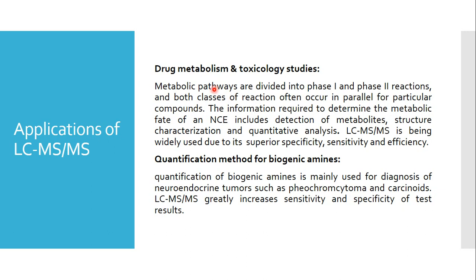Now let us see the applications of this technique. The first application is drug metabolism and toxicology study. As we know, whenever a drug enters our body, it undergoes metabolism, and these metabolic pathways are divided into phase 1 and phase 2 reactions. The information required to determine the metabolic fate of an NCE, that is a new chemical entity, includes detection of metabolites, structure characterization and quantitative analysis.